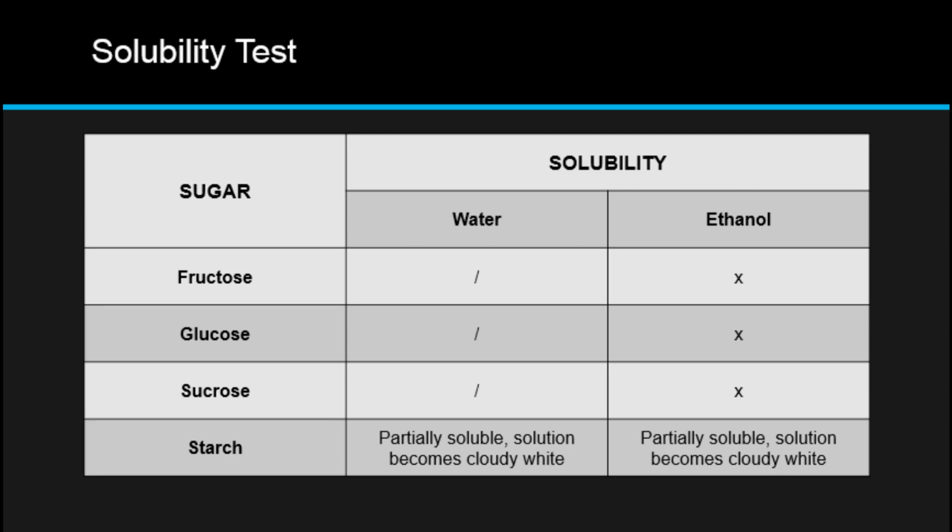So these carbohydrates are polar molecules. They have the hydroxyl group, making them attractive to the very polar water, dissolving the substance in the process. Their structure is also a lot simpler compared to starch. They have only 6 to 12 carbon atoms, making them highly soluble in water. So the OH groups of the carbohydrates are responsible for the solubility of the compound.